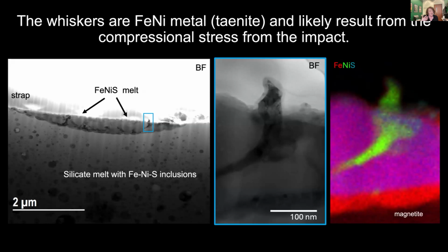The origin for these whiskers is still a little unknown. We think that they might be forming as a result of this compressional stress that forms when you have a micrometeorite impact, compressing the surface of the sample, and then it squeezes this material out from the melt deposit and forms these little whiskers or fingers that are sticking out from the surface.